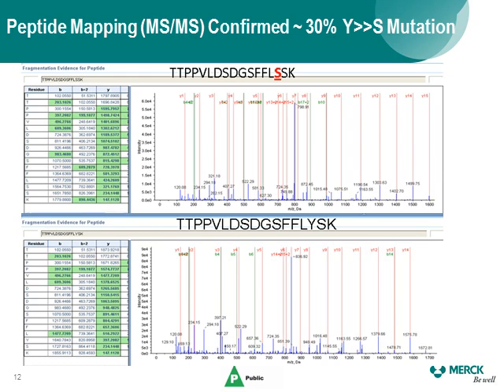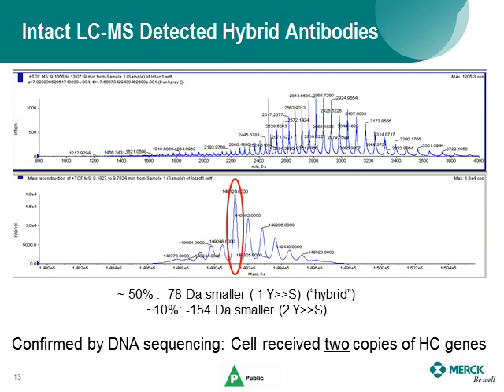MS/MS confirmed the mutation is tyrosine-to-serine in this peptide. However, from this data alone we were still not sure whether each molecule has one mutation or two mutations on its two heavy chains. To solve this, we examined the intact LC-MS data. The intact LC-MS analysis showed that about 50% of the molecules have only one heavy chain carrying the mutation while the other heavy chain is normal, and about 10% of the molecules have both heavy chains mutated. This was further confirmed by gene sequencing, showing the cell received two copies of the heavy chain gene and made a hybrid molecule.